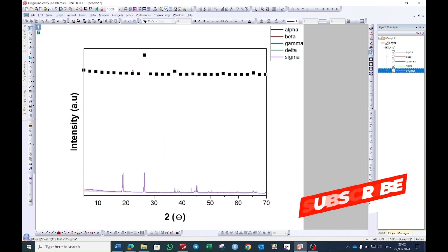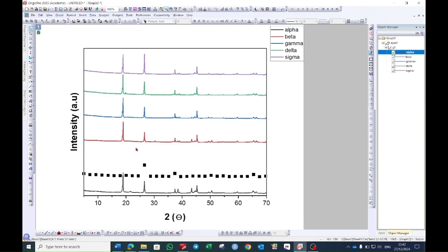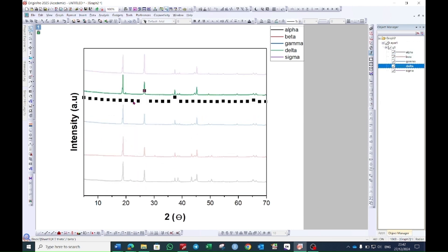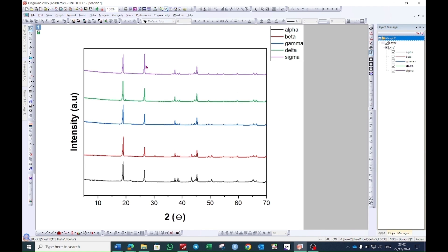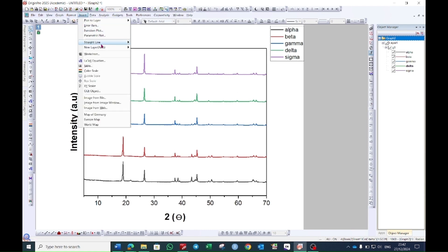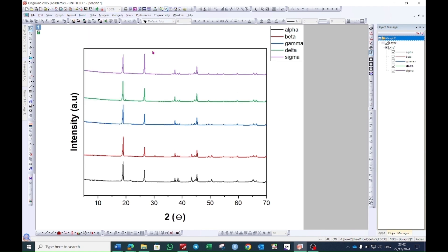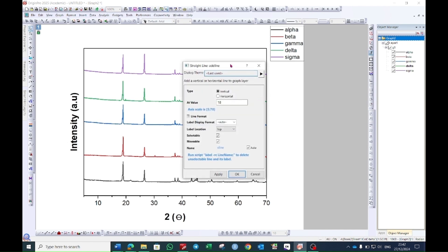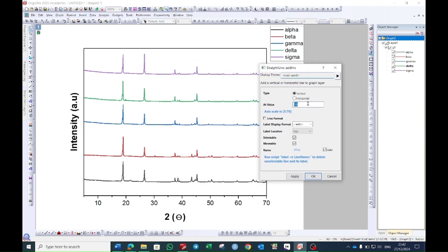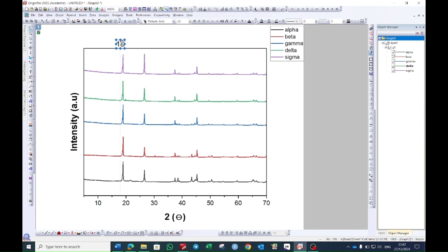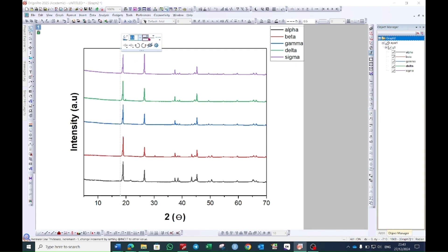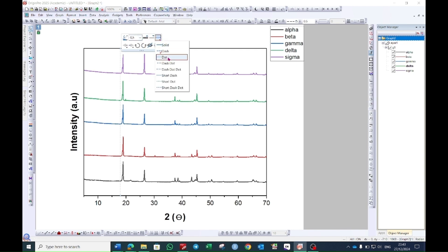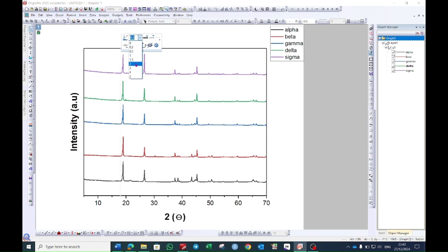Now select layers one by one and drag them to the top. After this, choose a layer to label your data. Go to the Insert option, go to the 'Straight Line' option, and then click 'Open Dialog.' In this graph I want to show my data on different values — select 18, then select this 18 and press Delete. Select this line.